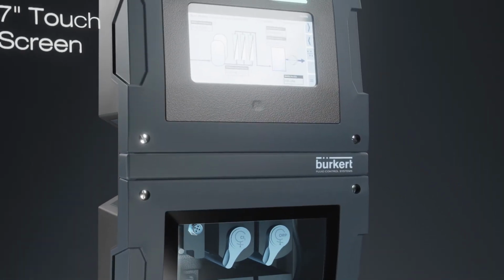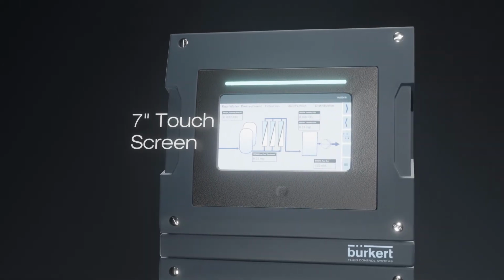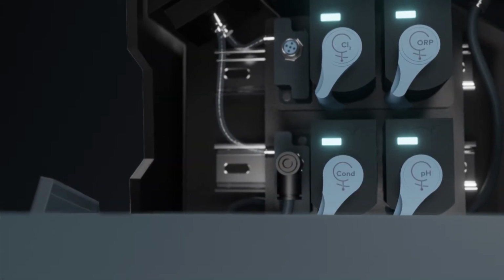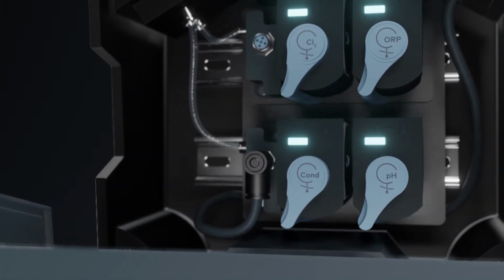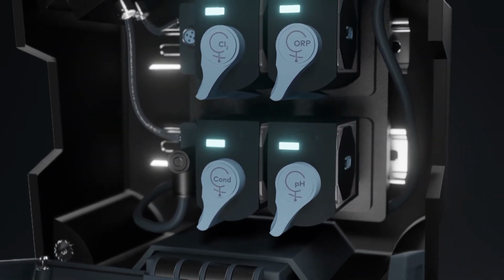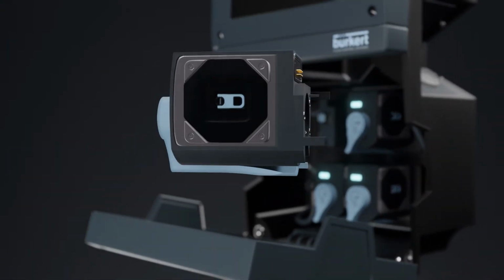Unlike other multi-parameter systems available on the market, the Burkert Type 8905 does not use a centralized processor system. Instead, the hot swappable cubes are actually transmitters themselves, independently communicating with the HMI and output cards found in the upper electronic module casing. The modular components allow for bespoke panel and housing solutions to offer a safe application environment.